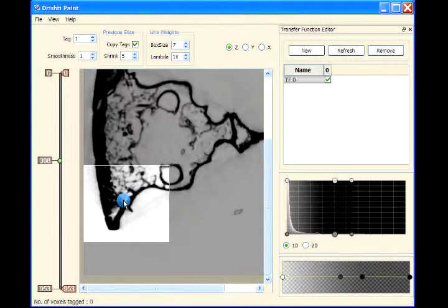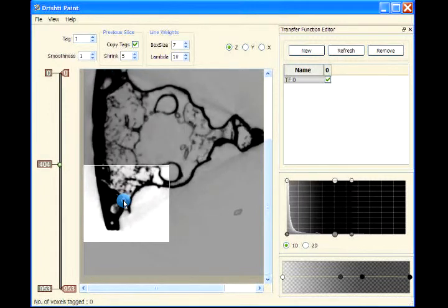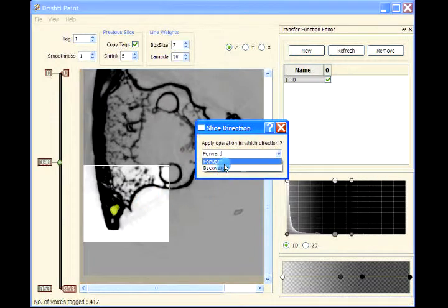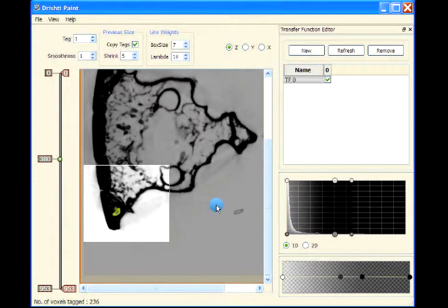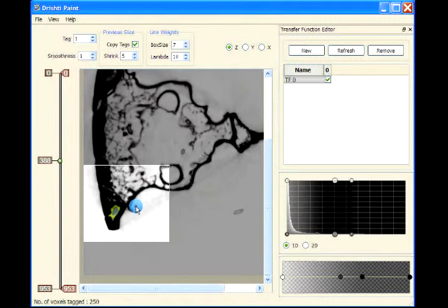Okay, now this is also part of that channel, so let's put a dot here, tag, press escape, shift T, and let's go backwards, meet the other part, and then we'll come back again. Okay, so it has met the other part, this one here. Now let's go forward.